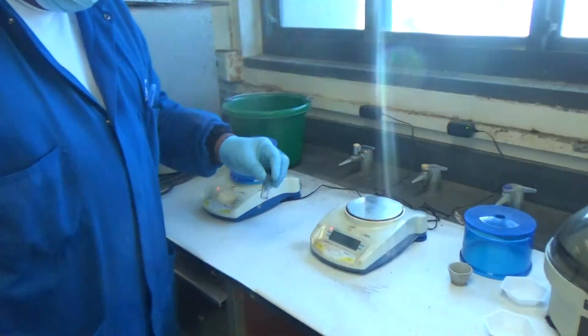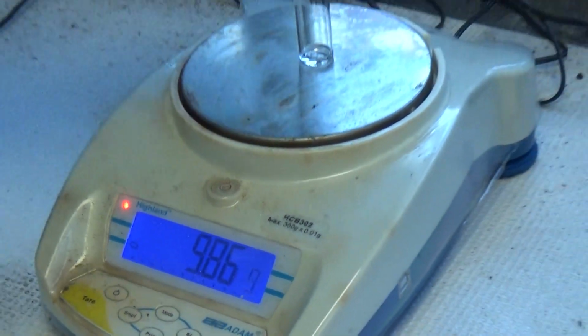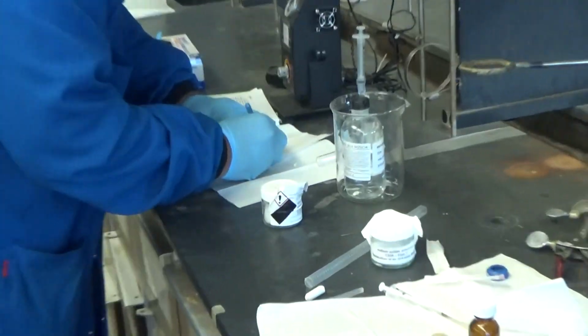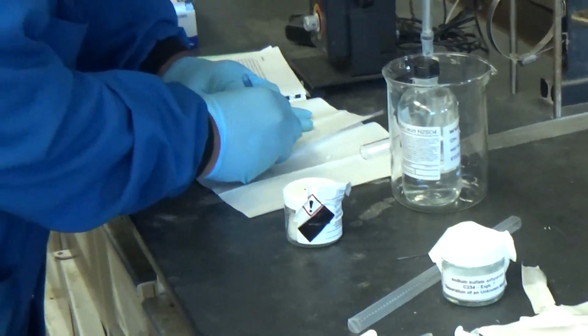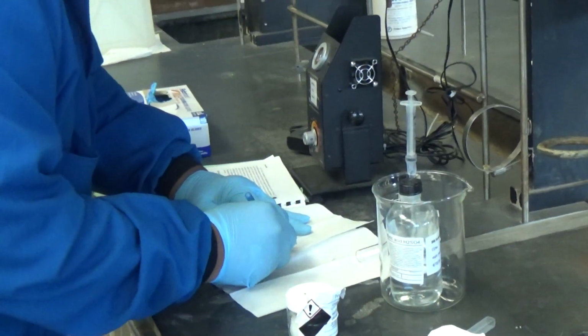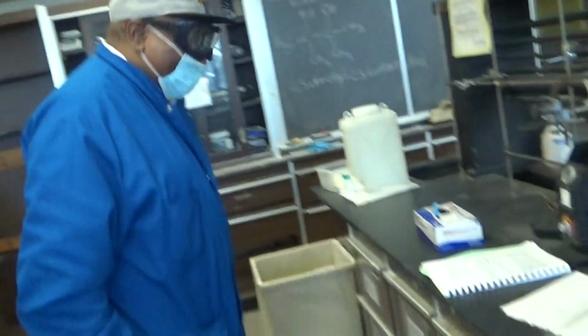So now you have 9.85. Cool. So that's 100 milligrams or 200? 9.85 minus 9.69 is 0.16, so 160 milligrams of product. Almost 200 milligrams of product. Very nice. It's got a weird smell. Don't smell it, okay.